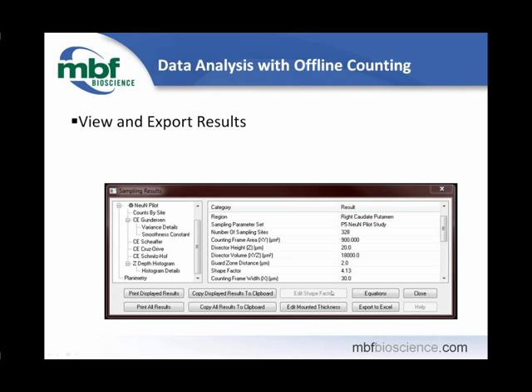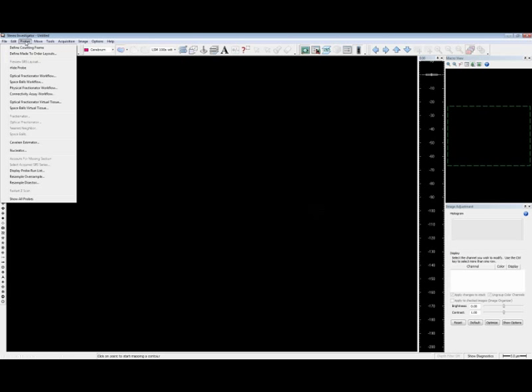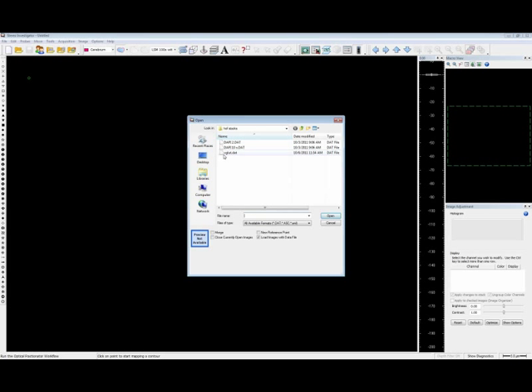So I'm going to switch to Stereo Investigator now. I'm going to place a reference point, and under the Probes menu, I'm now going to select the Optical Fractionator workflow. I'll select Load Subject Data from Existing File and browse to where that location is.